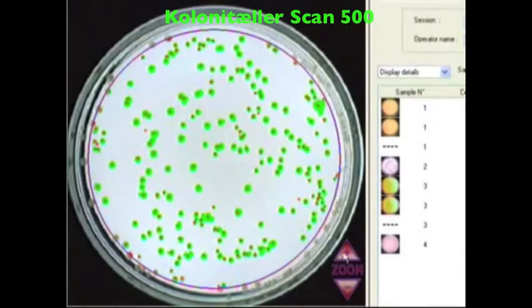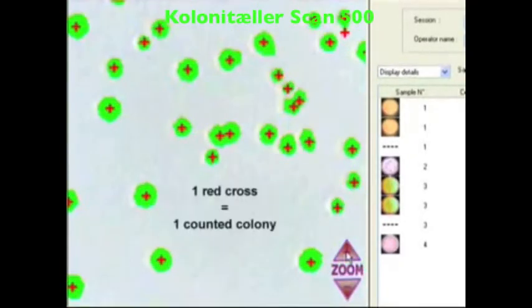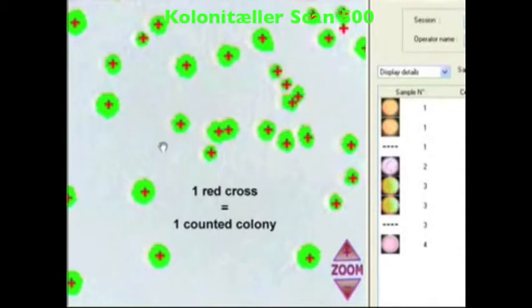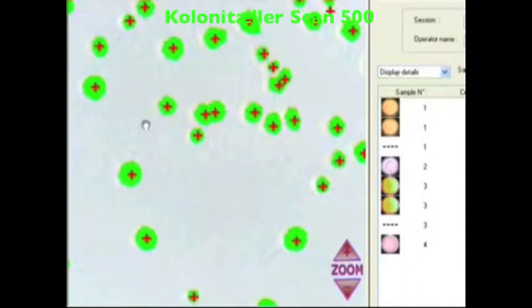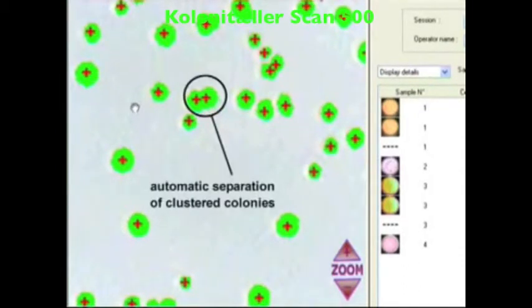Zoom in on the image. Each counted colony is marked with a cross. The separation of clustered colonies is automatic.